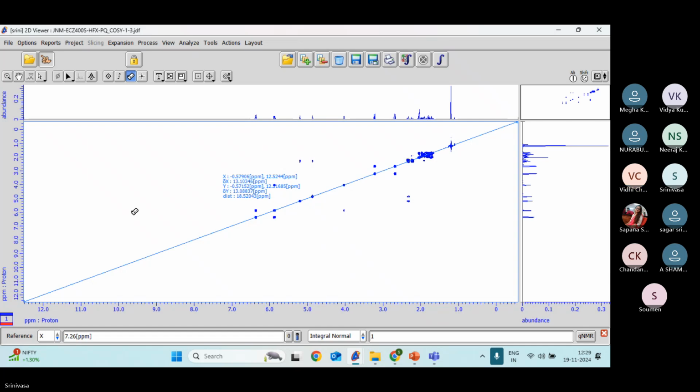can we undo it? Double tap the mouse, otherwise click on the home button, or the minus button. This will come back. Okay. So zooming again, I put the line for you to understand. Just go to zoom and zoom. Start from the diagonal. Stop at the diagonal.